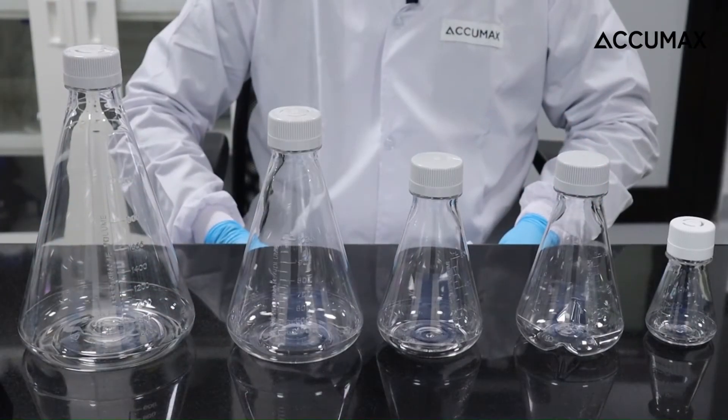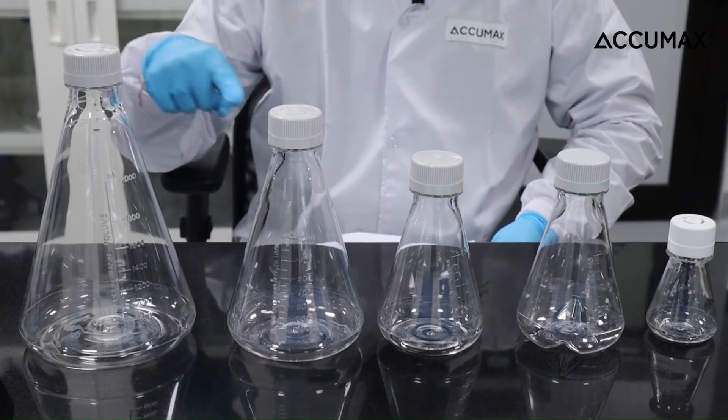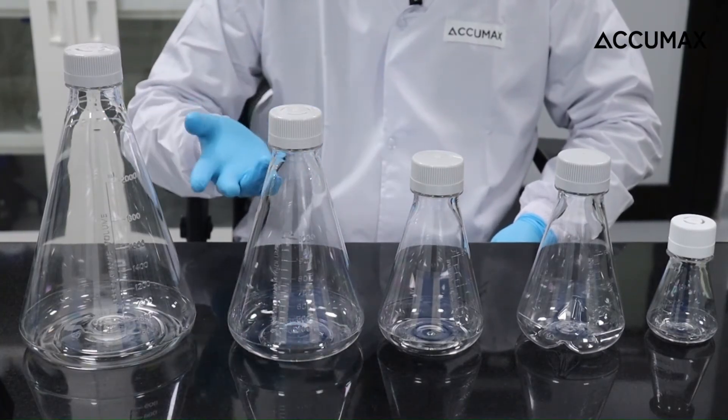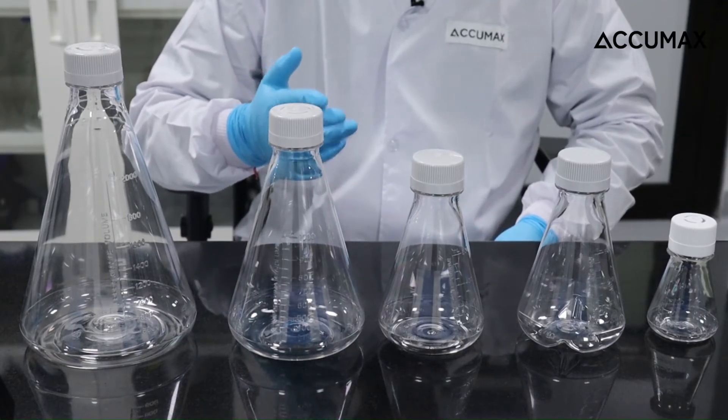The scalability of Acumex Aerolimere flask, from 125 ml to 3 liters, lets you mix and match different volumes of flask in your shaker, greatly improving your space efficiency.